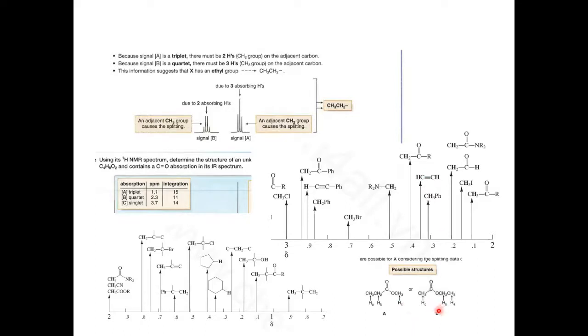So this is a possible structure if you combine all data from chemical shift and integration. So this is 2 possibility. Now why we rule out this B possibility from this one? Because OCH2 is not possible. If this is a structure, then you will expect this quadrat at 3.7, which is not. So this quadrat is not 3.7. So 3.7 is only one singlet here.